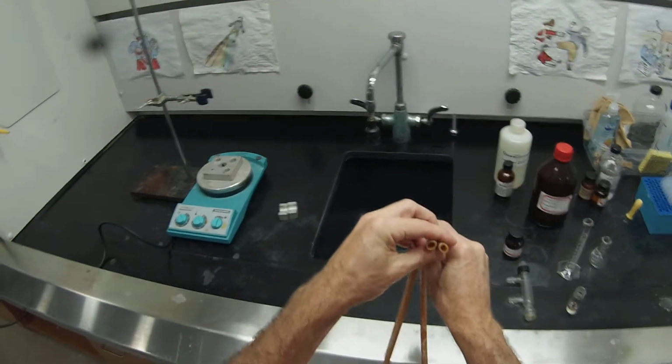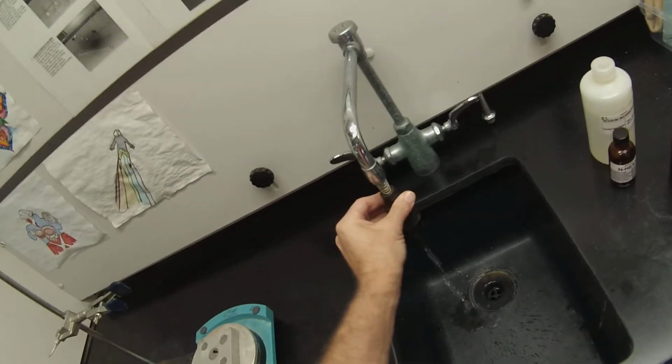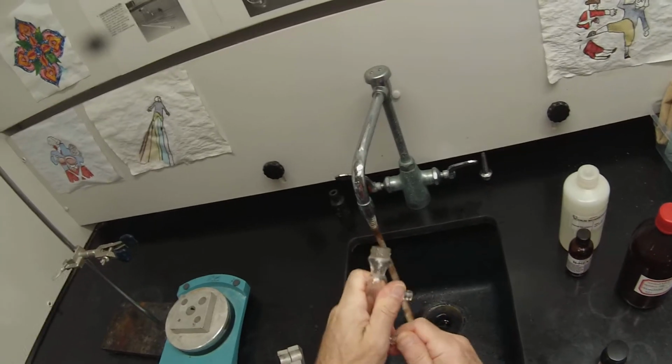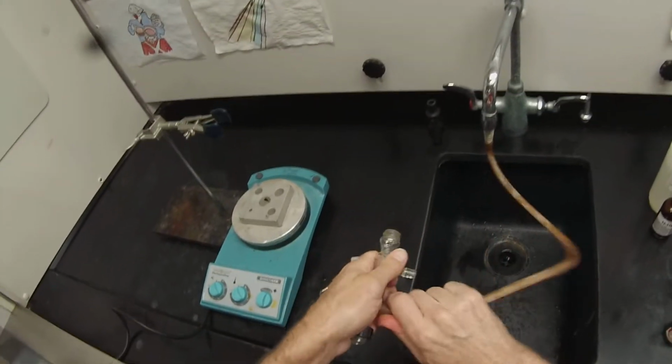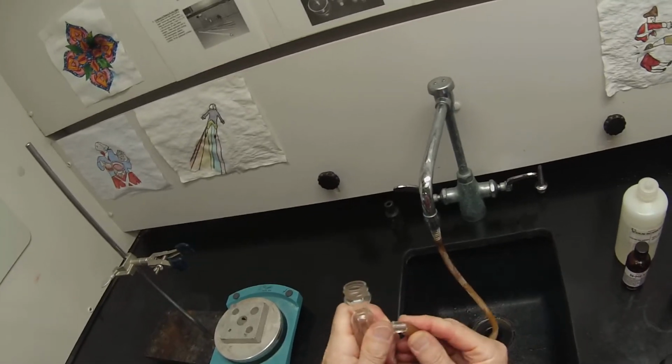So it's a fairly simple setup. We're going to need our 2 pieces of amber tubing, with the larger of the diameters. So that's for the condenser hose. And since it's always easier to put that tubing on if you wet it a little first, I'm going to fill a beaker. And we can take this off since we're going to need to attach our hose to that. So that'll be our inlet hose. It'll go to the bottom end of the condenser. I'll get that on nice and tight so it doesn't fly off when we don't want it to. And then this will be our exit hose coming out the top. That way the condenser will fill completely.